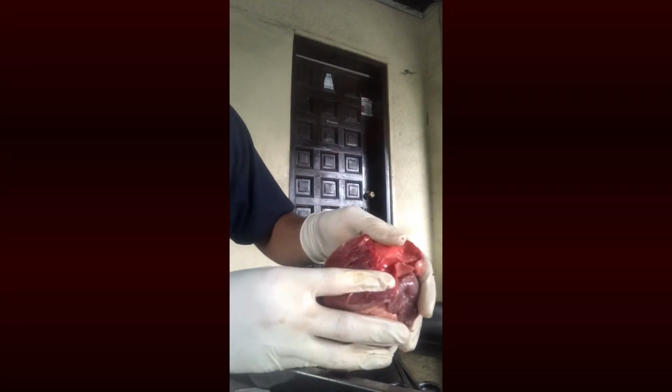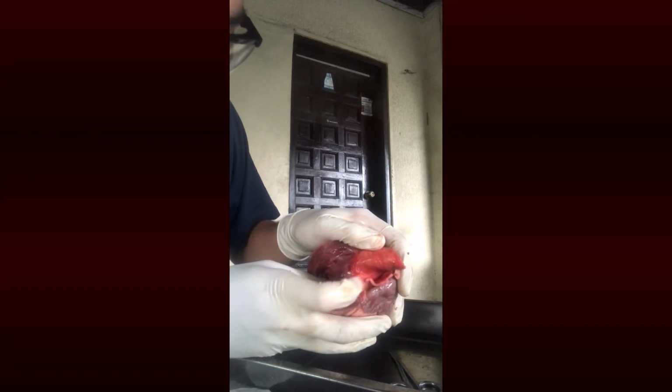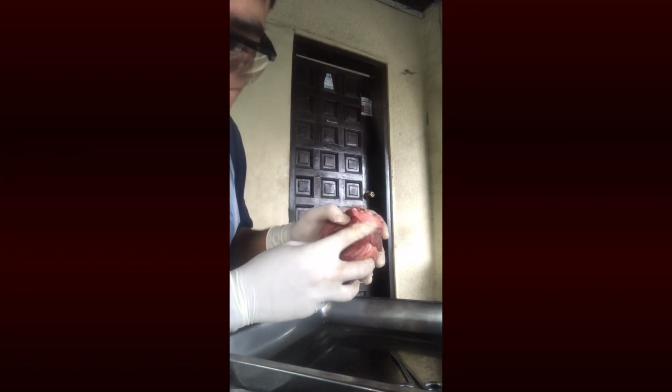Inside the right ventricle, locate the pulmonary artery that carries blood away from this chamber. Find the one-way valve called the pulmonary valve that controls blood flow away from the right ventricle at the entrance to this blood vessel.